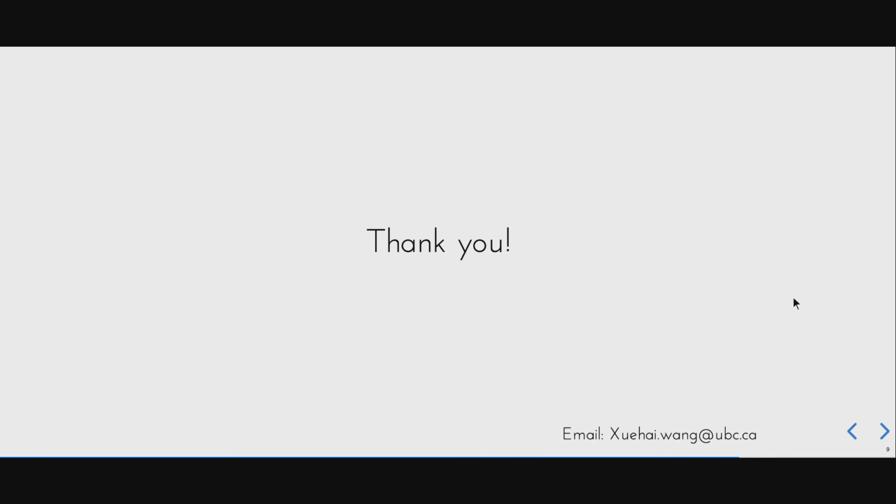Currently, it's a fantastic question. I think the tool can currently only be applied in our lab with our very specific panel design, because this is custom built for our panel. We have to acknowledge that the flow cytometry assay is quite unique to each lab, especially in North America.